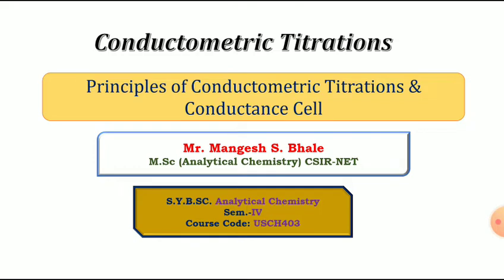In this video lecture, we are going to learn the principle of conductometric titrations and the conductivity cell. In the previous lecture, we completed the chapter on pH metry. In this video lecture, we are going to see the principle of conductometric titrations and the conductivity cell. First of all, what is meant by conductance?